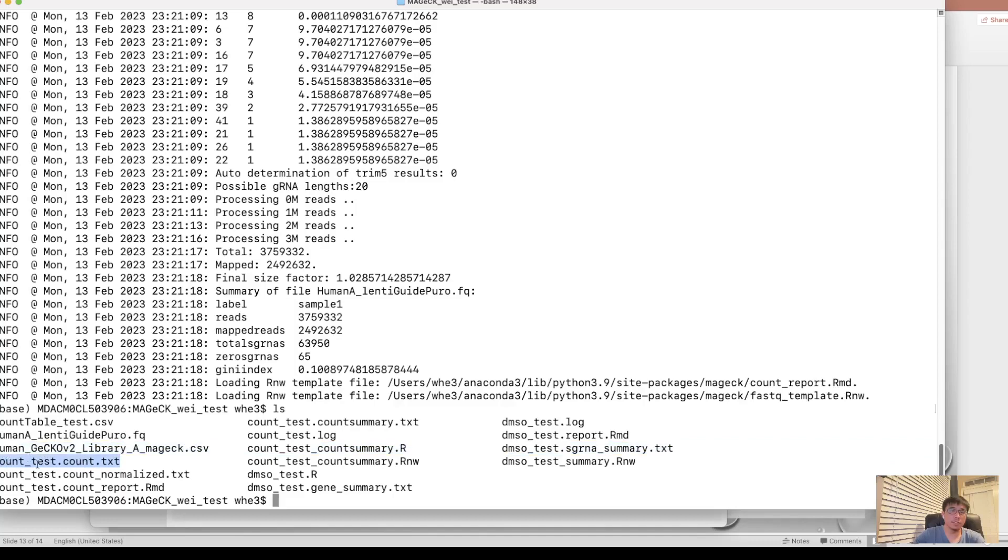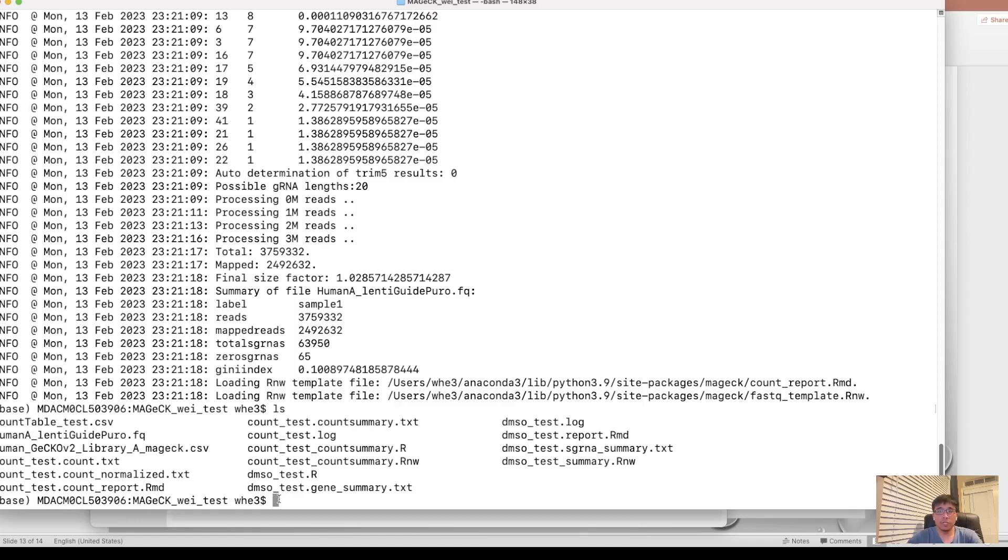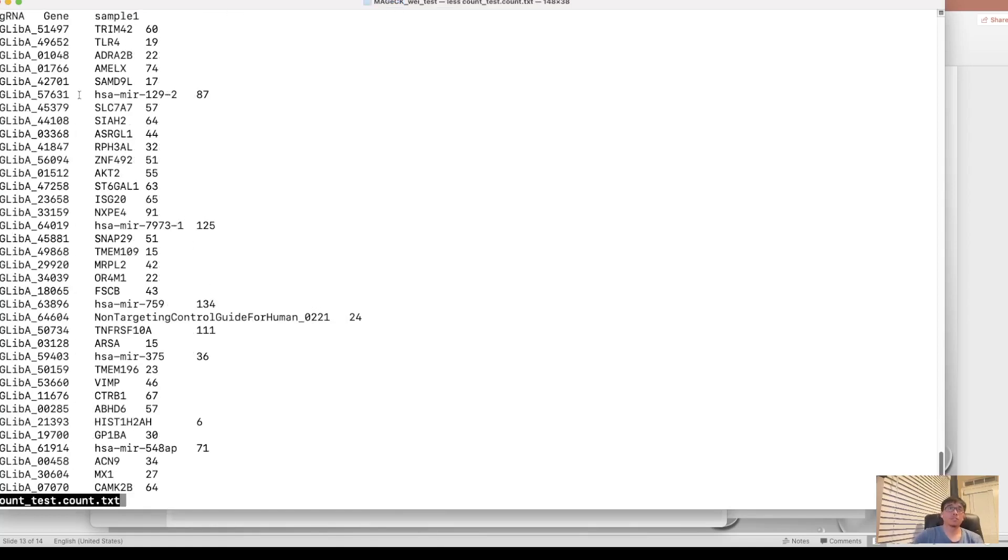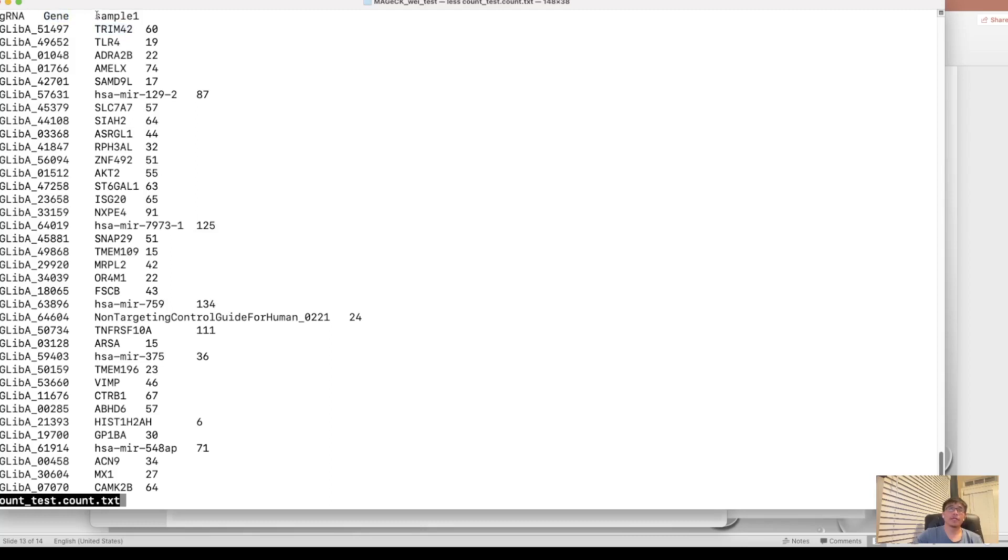This is the prefix we set in the parameter. And the .count.txt is the count table, read count table for each sgRNA. We can generate it. We can look into it. Count.txt. See, it has three columns. One is sgRNA, the first column. Second column is the gene symbol it targets. And the third column is the count for each sgRNA.